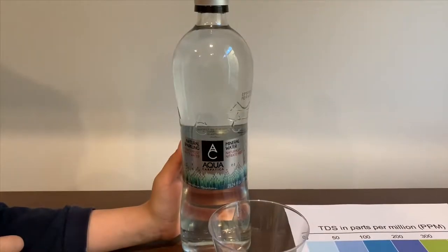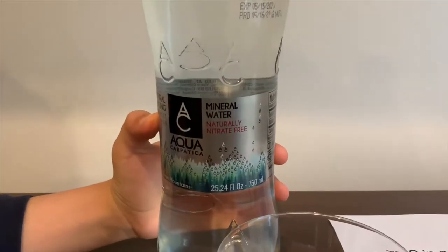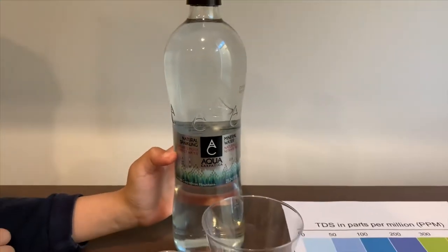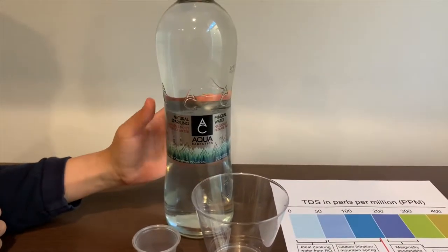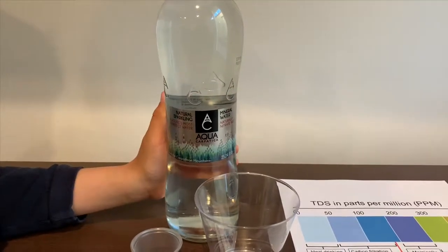This is Aqua Karpatica Natural Mineral Water. It costs $2.29 and is sourced from Romania. Remember we tested the still version of this? Its TDS was 170 and its pH was 8.2. Let's see how this compares.